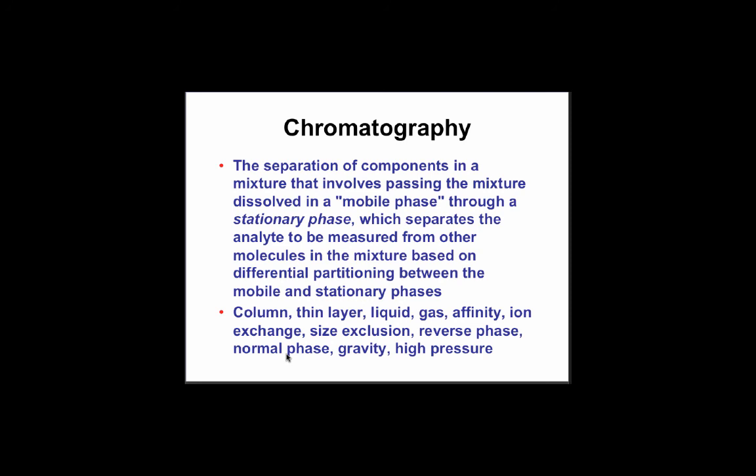And they cause a separation or a delay in the movement of the mobile phase down the stationary phase. So in chromatography, you can separate things by columns. You can also separate through plates or thin layers. The mobile phase, as I say, can be liquids or gas.